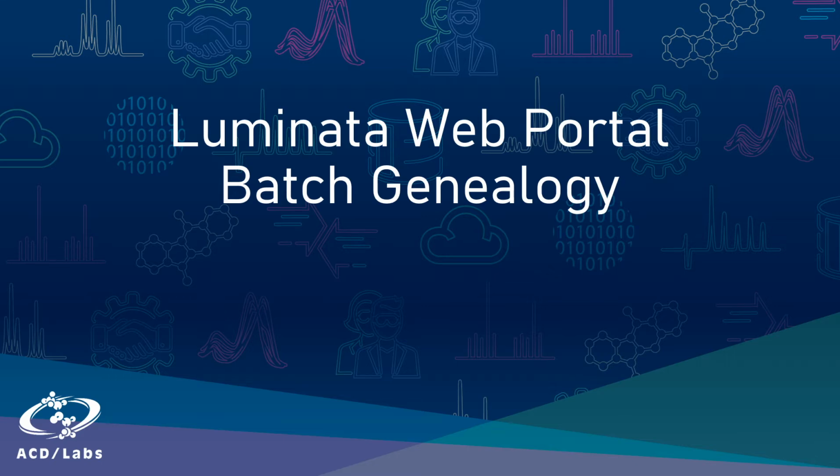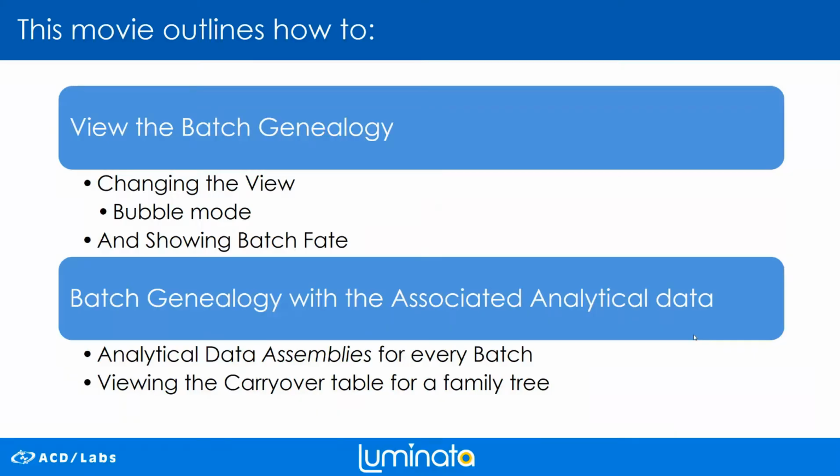Welcome to ACD/Labs Luminata, the web portal for batch genealogy functionality. In this movie, we will describe the capability of viewing the family tree of a project by showing the batch fate. We will also show the batch map with the associated analytical data.